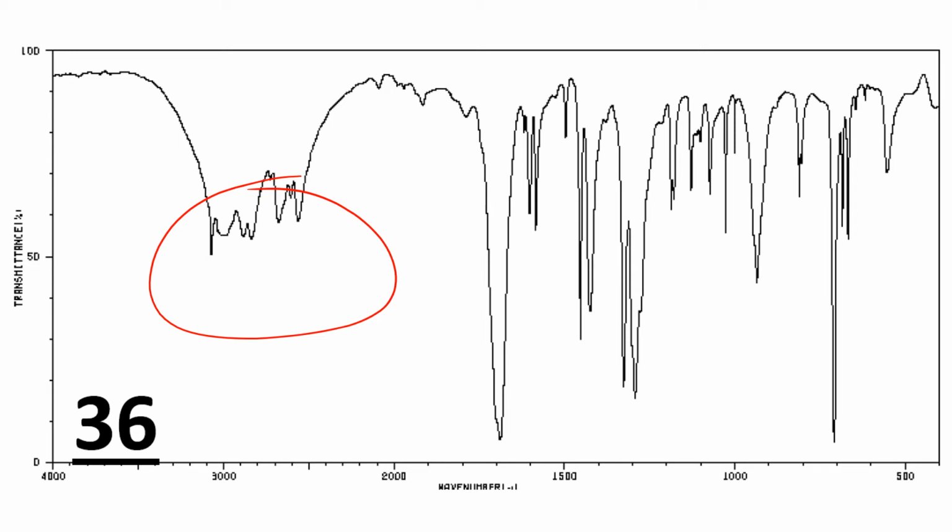This peak is not particularly strong. I would describe this as a medium strength, broad peak at between 3200 and 2500, roughly. Although once you identify the molecule you're dealing with, you can be more specific with your descriptions. You can say specifically, this is an O-H stretch peak present in the 2500 to 3300 region, and it overlaps a C-H peak present also in the 2850 to 3000 region. So this peak right around here, if it's narrow, is going to mean C-H is present. If it's broad, it's going to mean C-H and O-H are present.